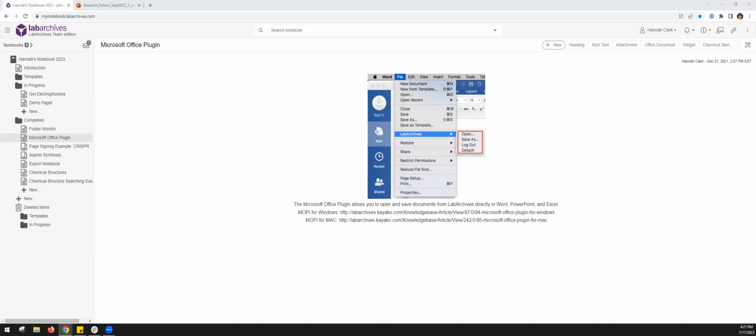Very good question. Okay. When linking files from other software, what happens if in the future that software is no longer accessible? Expired license, discontinued, unsupported. Is the linked file at least maintained as an image as it would be in a hard copy notebook? A trivial example, would the Snapgene plasmid map disappear if the license for Snapgene was discontinued by the university? What about a big Prism file? Will it still be able to open the file and use the data?